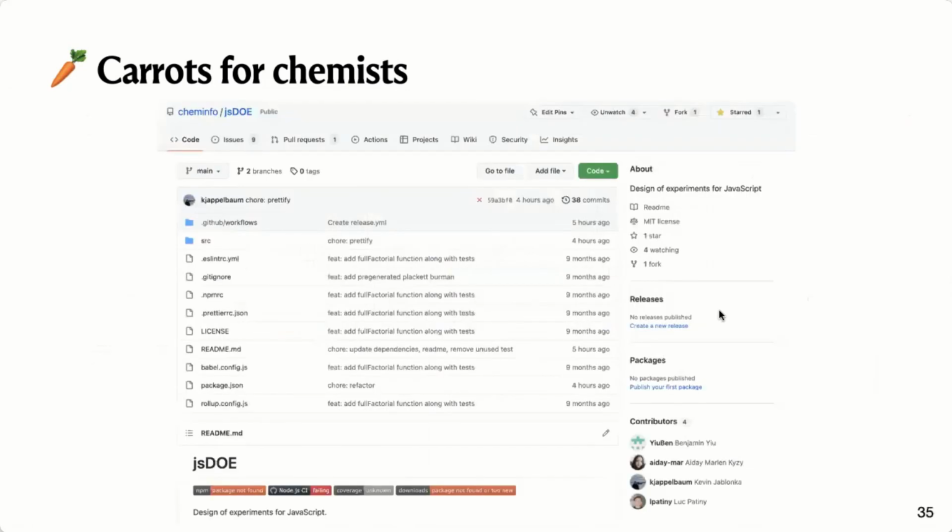A recent addition is that I had some interns helping me to also bring DOE, design of experiments, into the ELN. So this is important if you do a screening, like the second part of my talk, if I want to optimize certain things. It's really important that you have a good grid of experiments to do, because often you would just naively do one factor at a time: first you change the temperature, then the amount of solvent, then some other things. This is quite inefficient.